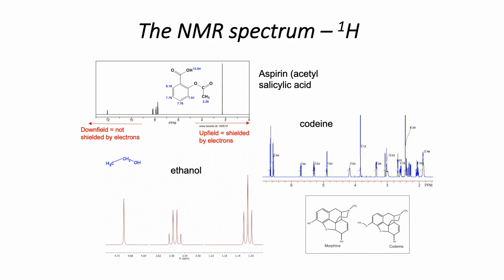So you just see an average of the chemical shifts, meaning it gives you a single peak rather than splitting into a triplet. These didn't come out very big, but it just shows that with bigger molecules, you get more peaks. If you zoom in on these, you'll see that a lot of these do not give simple triplets or quartets or doublets, that you've got a lot of more complex splitting going on in the molecule.